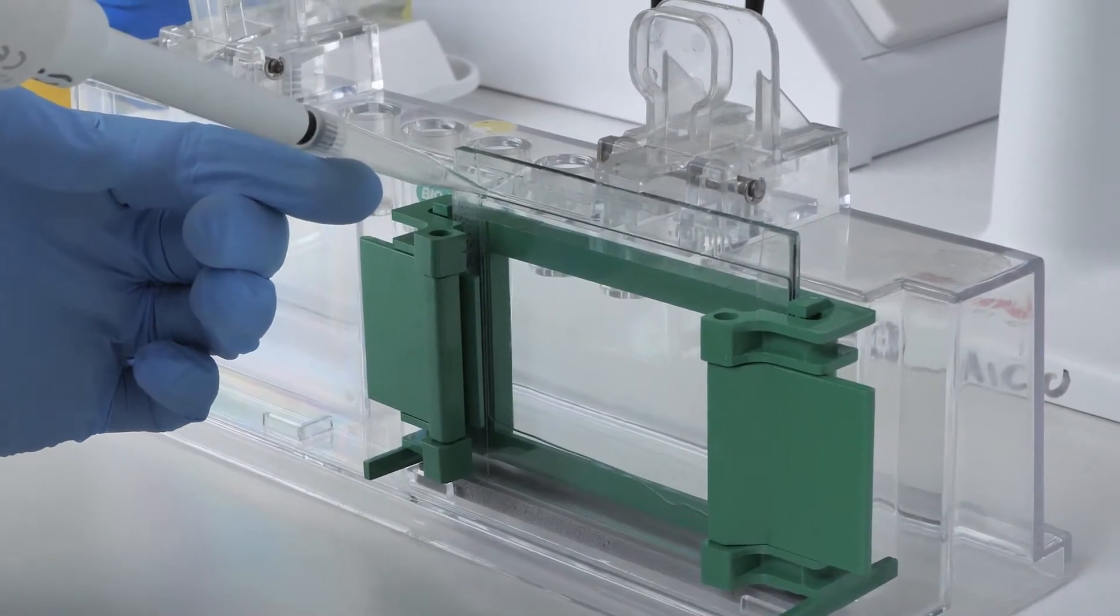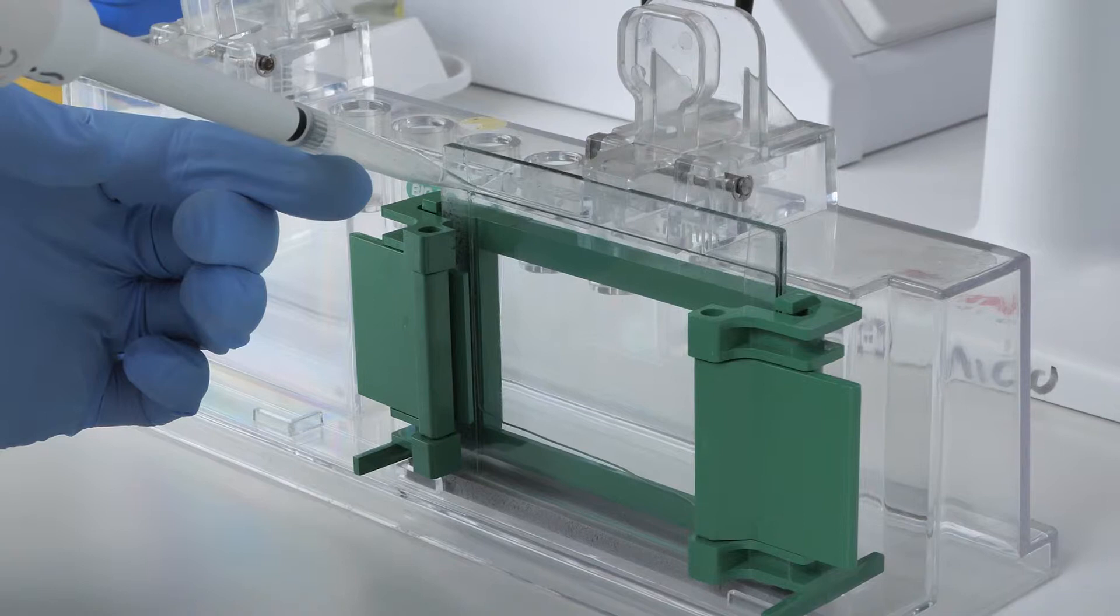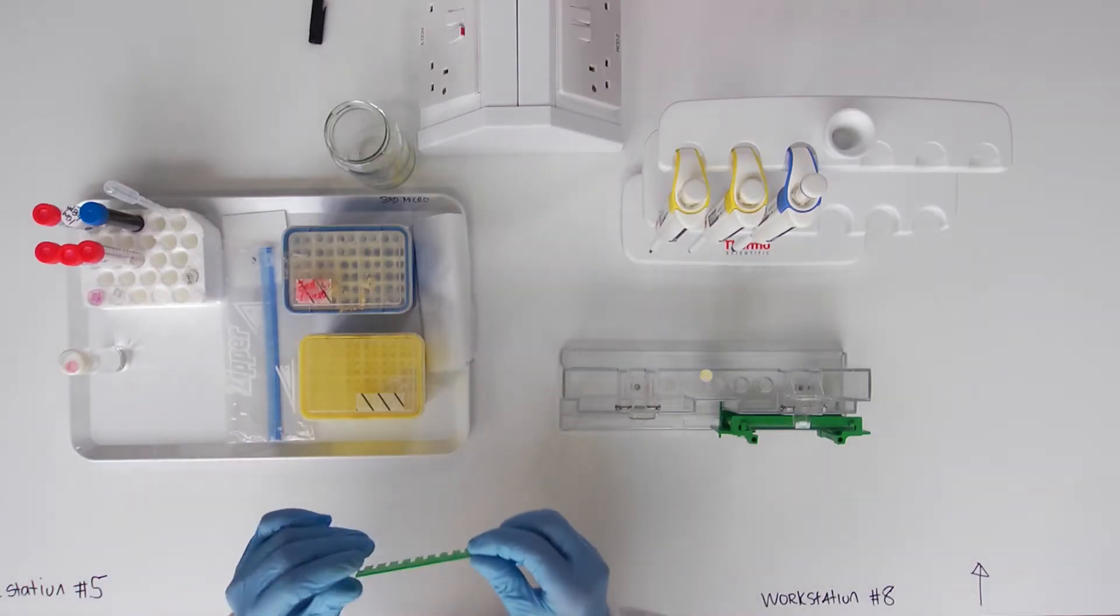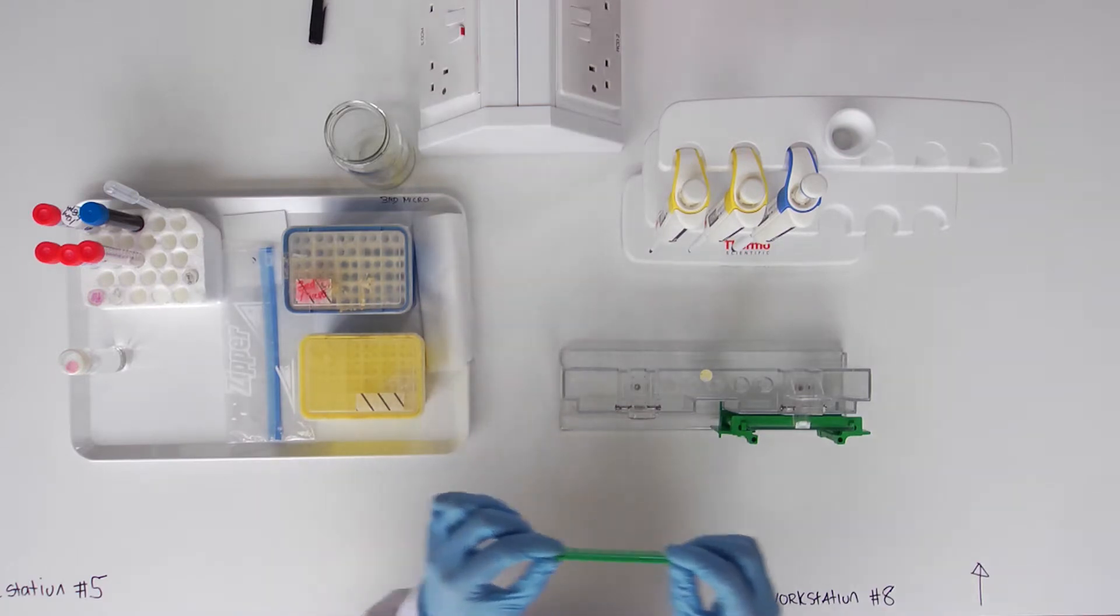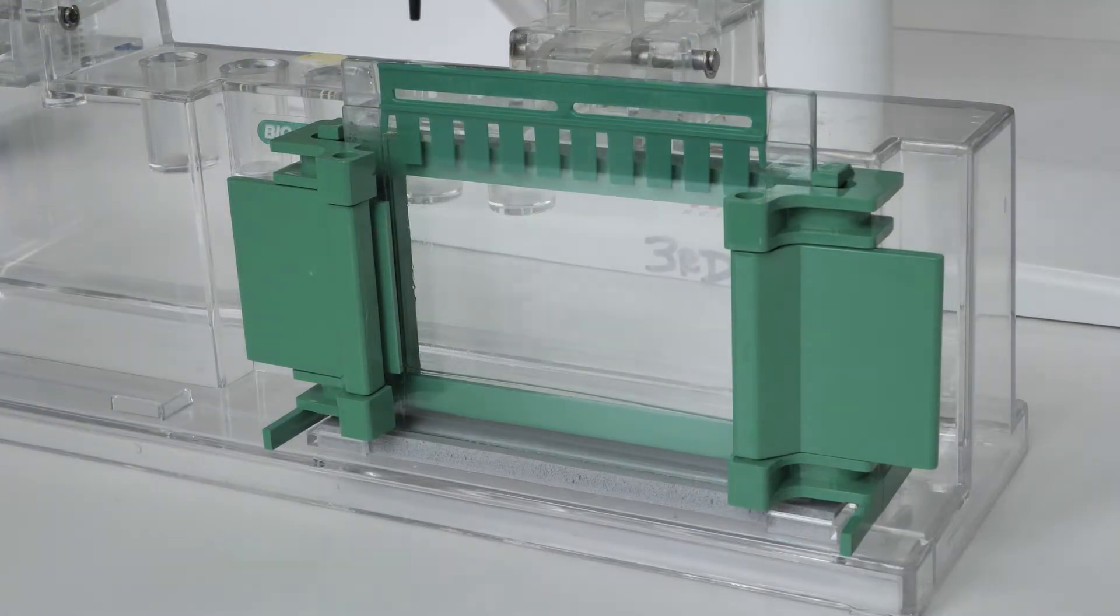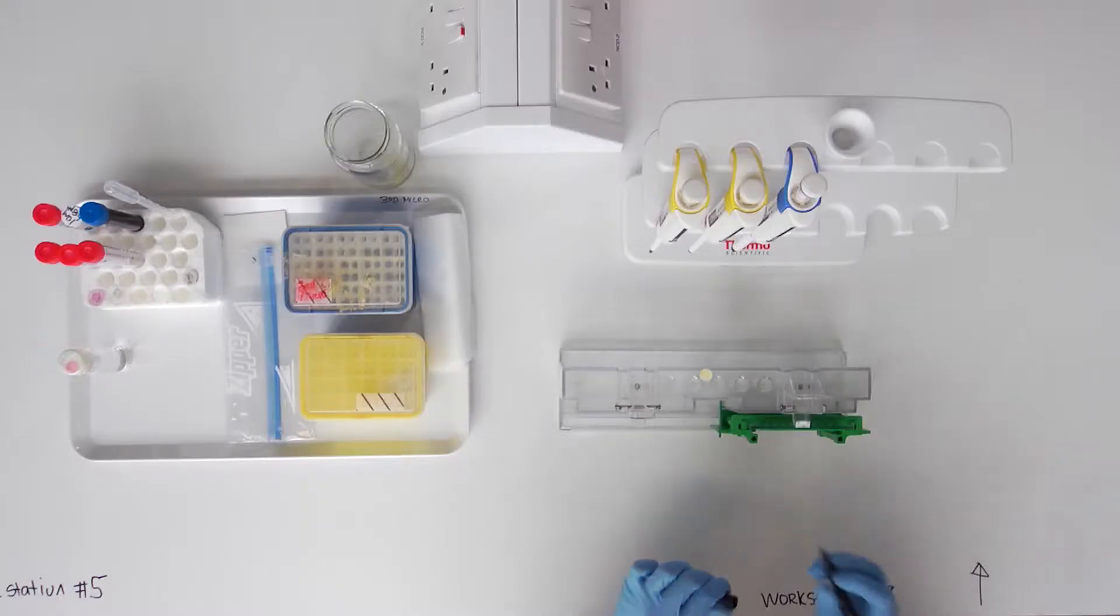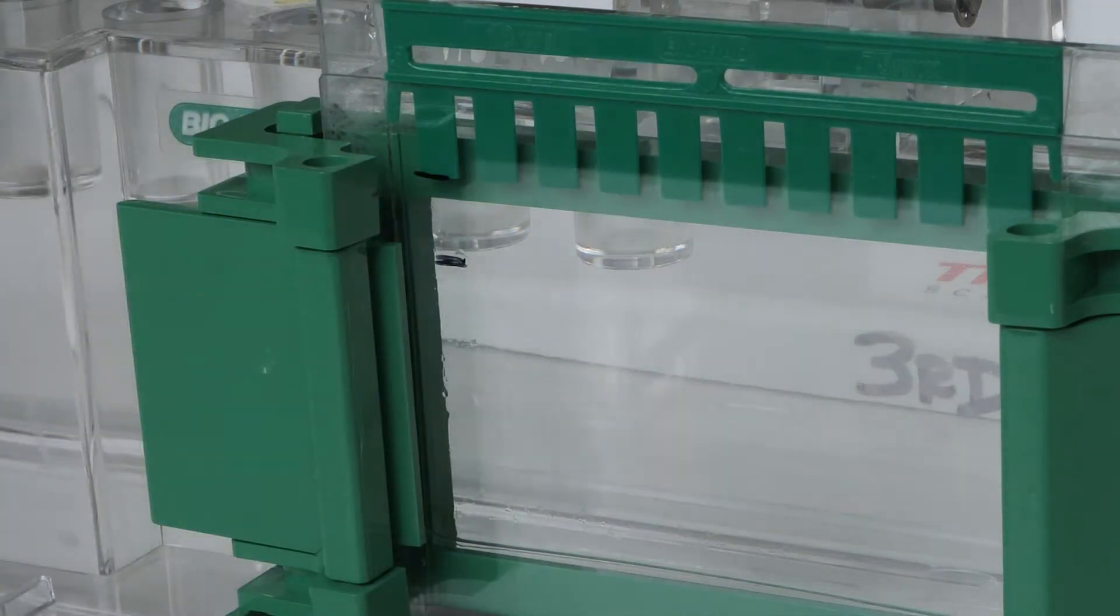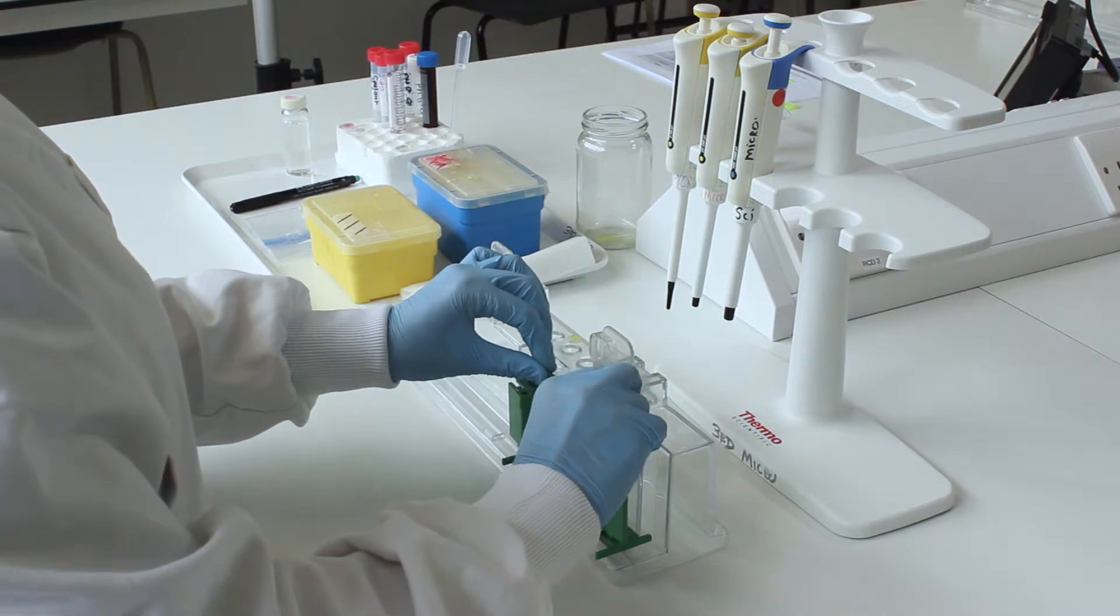After the sealant gel polymerizes, which typically takes between 10 and 20 minutes, insert the comb between the glass plates and make a mark on the front plate approximately 1 cm below the bottom of the teeth. Remove the comb again.